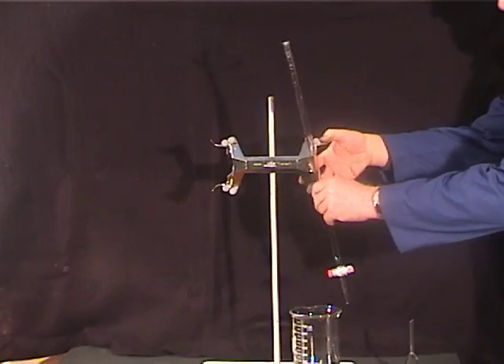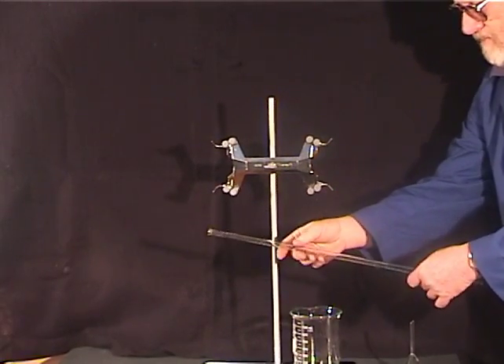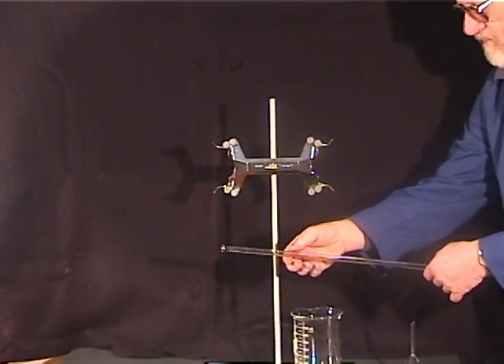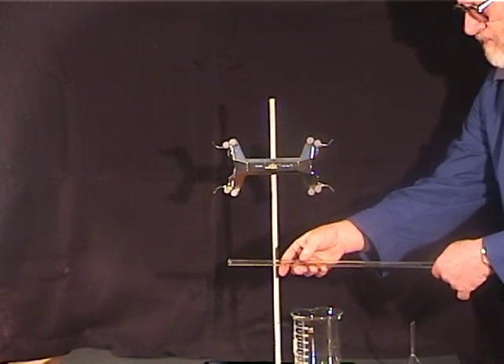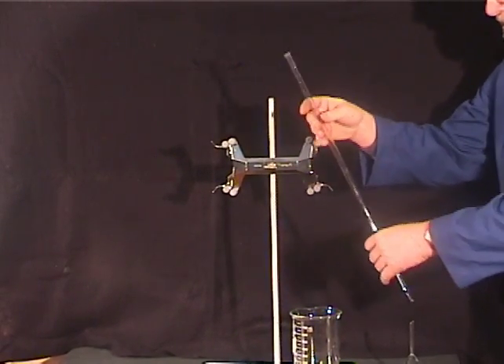To rinse the burette with the titrant, hold the tube in the near horizontal position and rotate it to rinse as much of the inner sides as possible. Then discard the rinse.